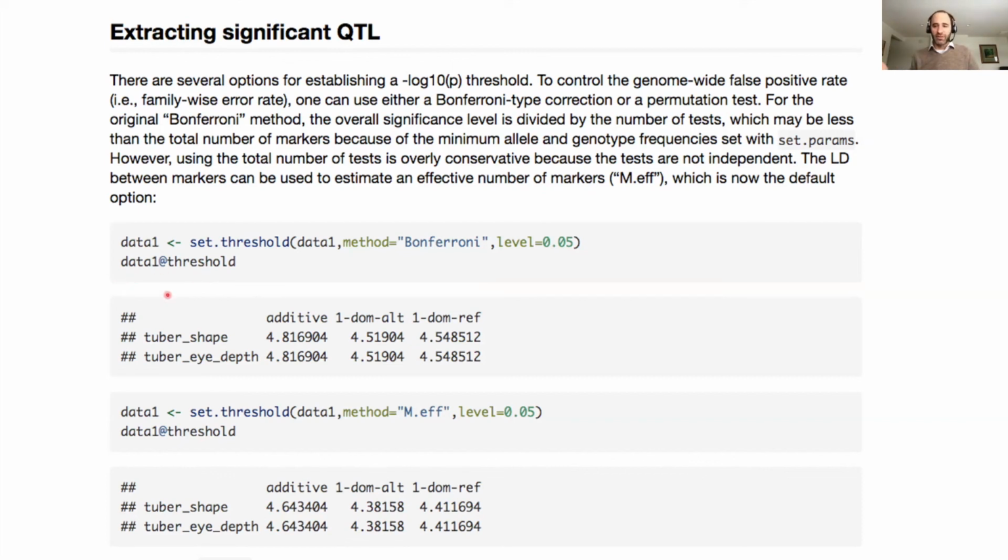And if you're ever in doubt about something, when you get something from a function and you wonder, what is this thing? I always just type str, and I give the name of that variable, which is short for structure, and then you'll see all the guts of that object, and you'll know exactly what is there if you want to dig inside of it. Of course, that's considered bad practice from a software design perspective, but we're too pragmatic to worry about that, I think, in this community.